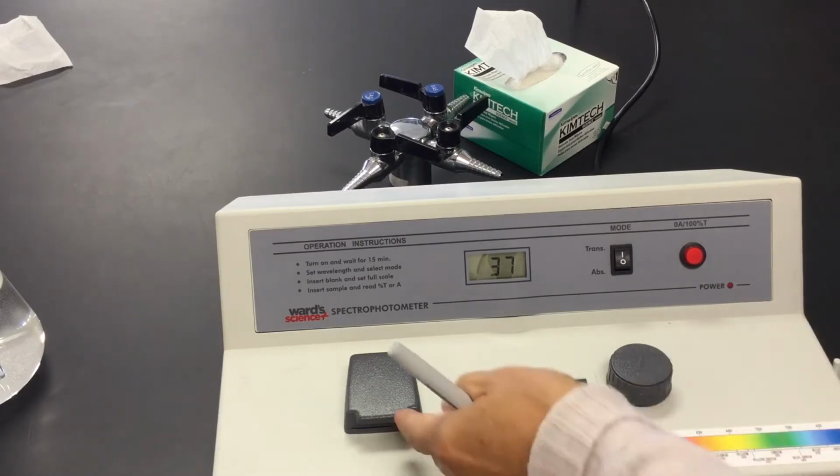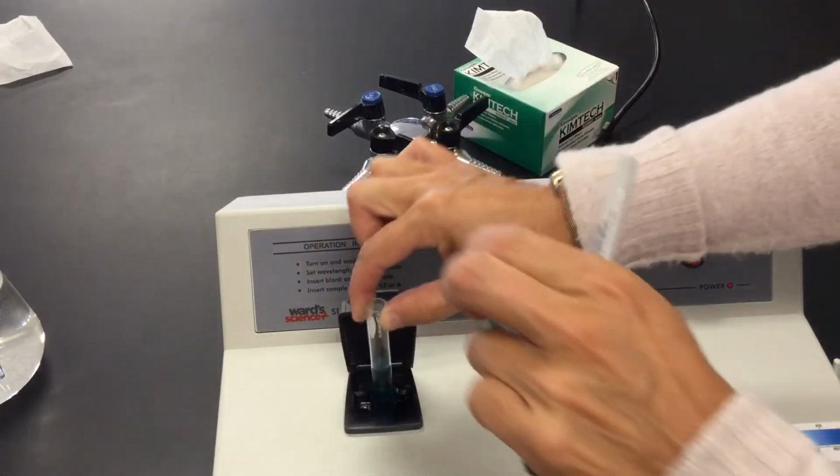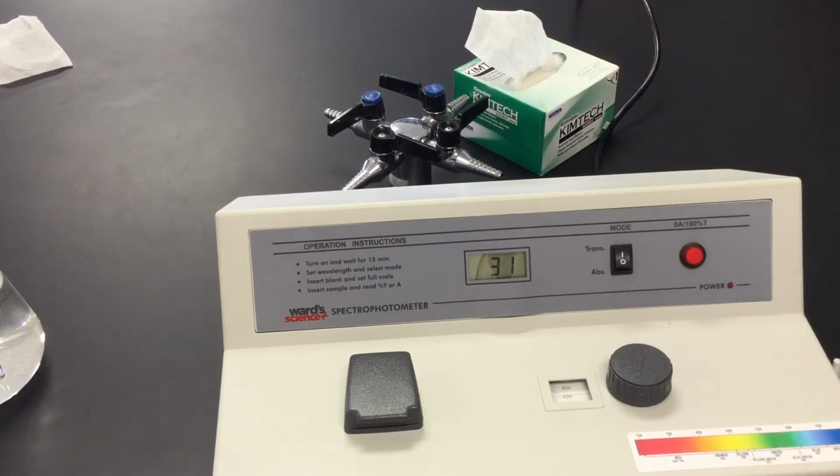Going to tube number 7. Let's go back to absorption. So we only need to zero it out with our first one, which was water, which was our blank. We're staying at our maximum absorption. I'm not changing wavelength. Now absorption for tube number 7 is 0.50. My transmittance is 31%.